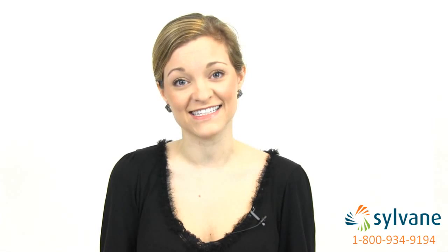Hi, I'm Maggie with Sylvane, and I'm here to show you how to test your air for formaldehyde using a formaldehyde test kit.